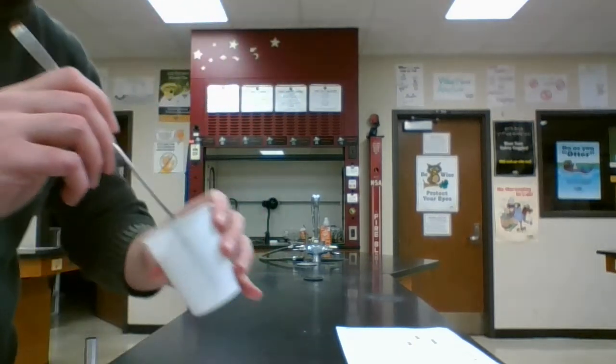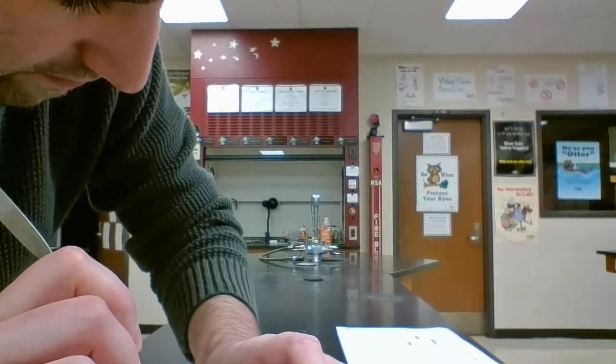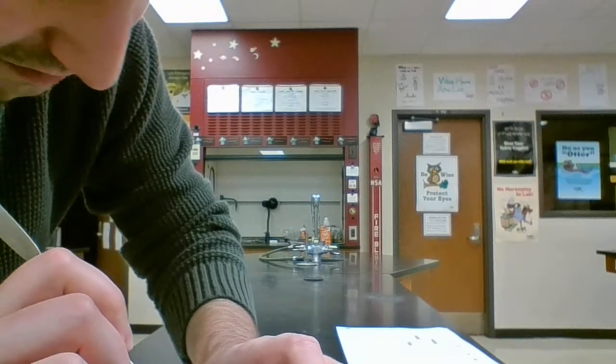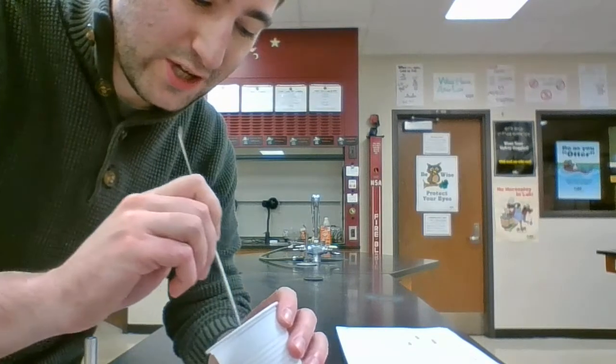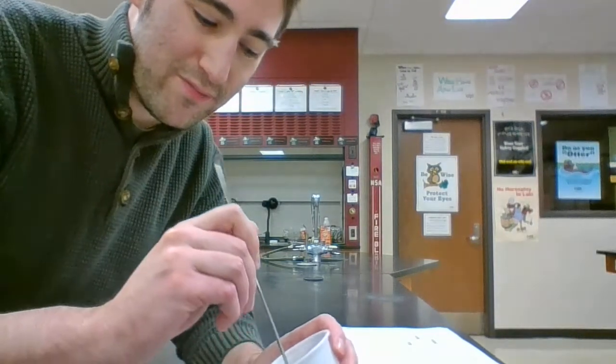Now, if I get this close enough, you might be able to hear there's a noise coming from this. And we're getting a change here. This ends up being a chemical change, but there should be some clues that tip us off to the fact that this is a chemical change.